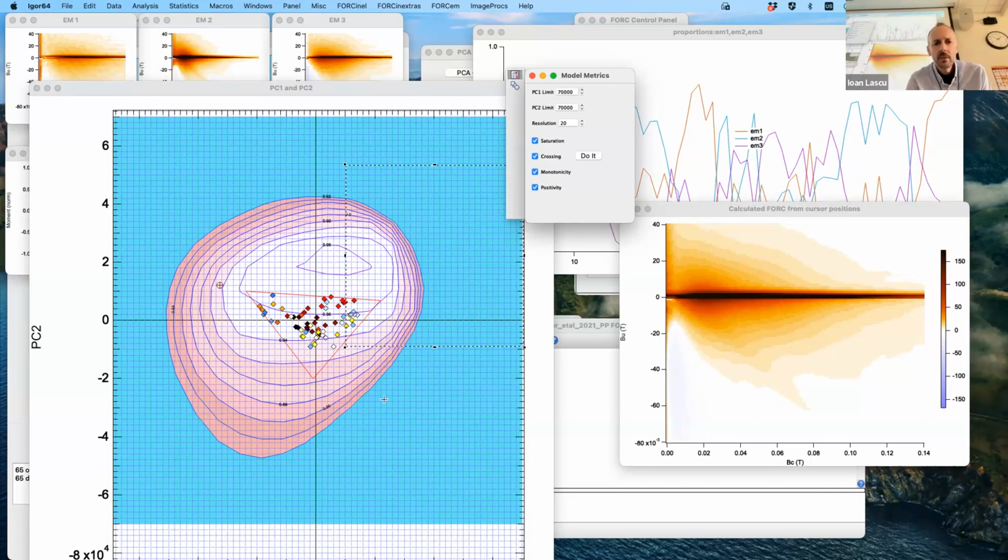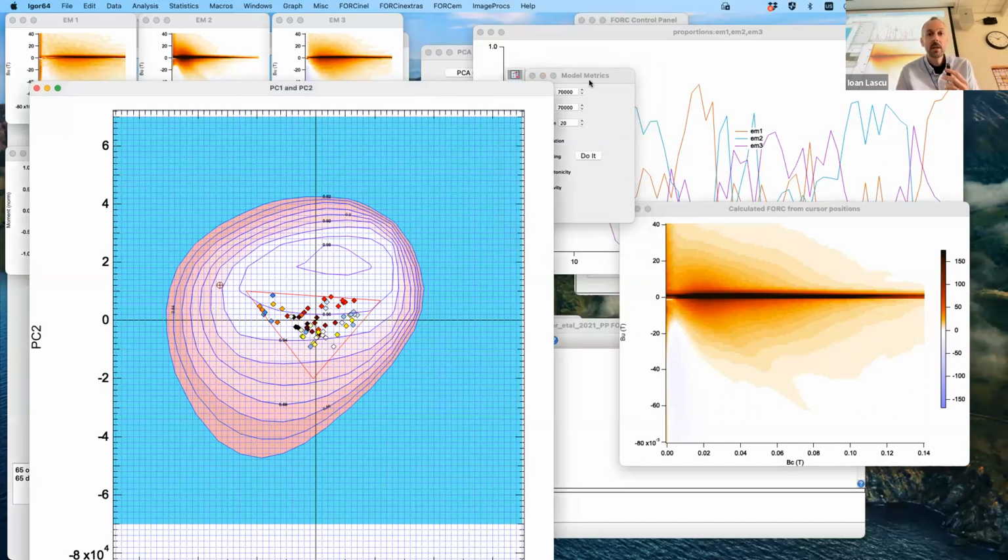So I think this run, yeah, combining all 4 of them kind of did this, which resembles what the positivity metric showed us. So that's why I'm saying this, it seems like the weight of the positivity took over on this one. I think that's what's happening, unless Rich has any other ideas, but anyway.